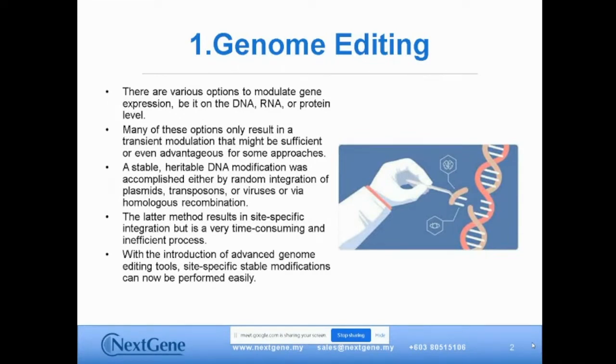Okay. So the DNA modification resulted in a site-specific integration, but it's a very time-consuming and inefficient process. However, with the introduction of advanced genome editing tools, this site-specific stable modification can now be performed, I would say, more easily.